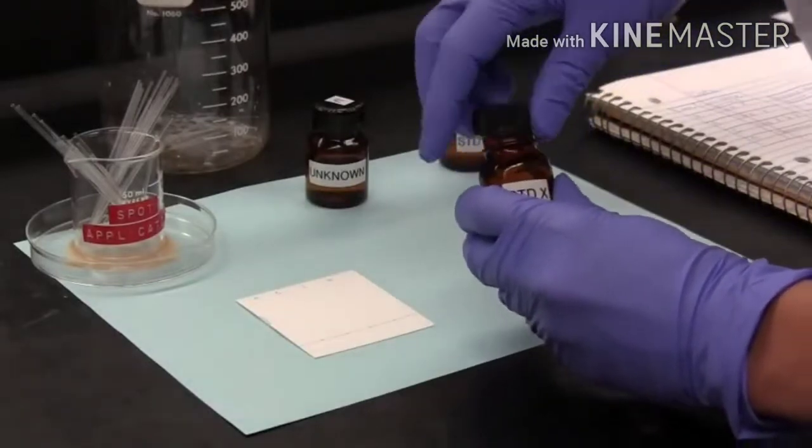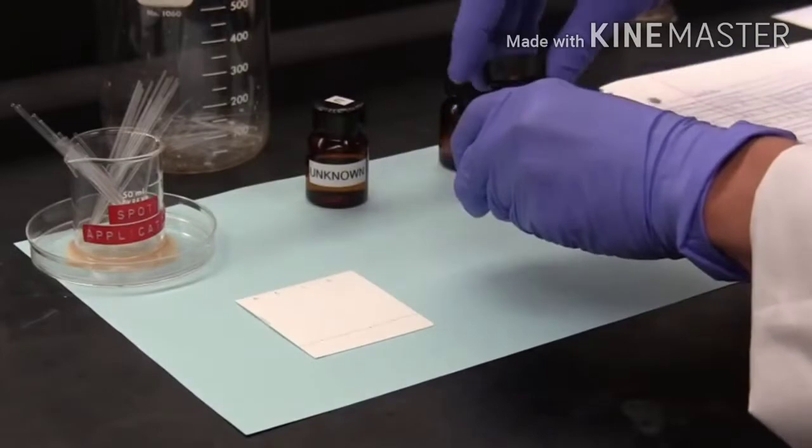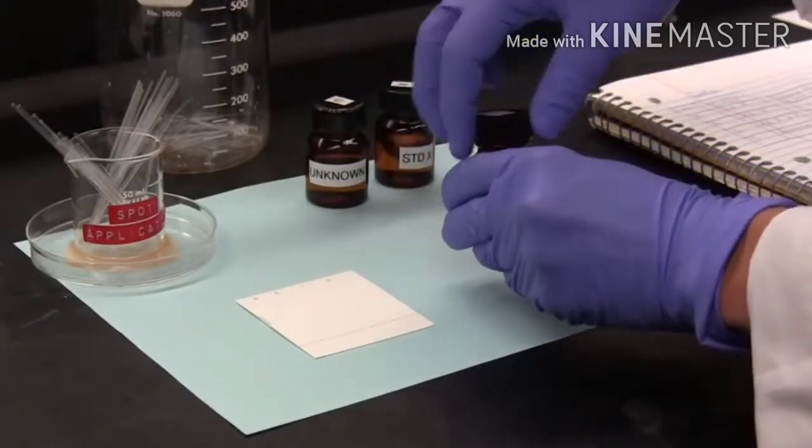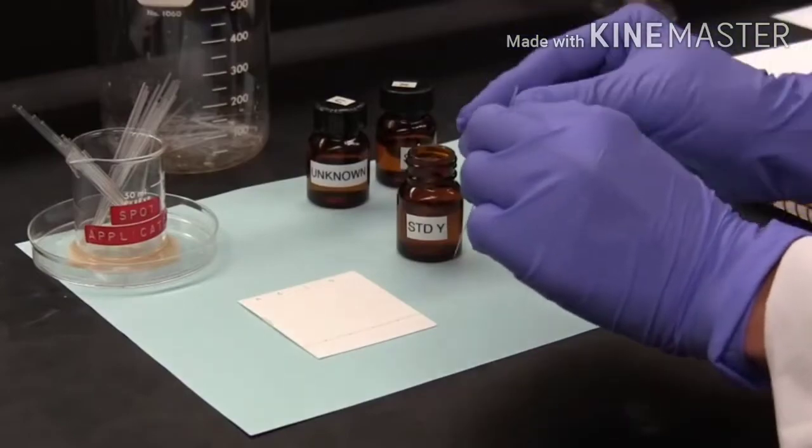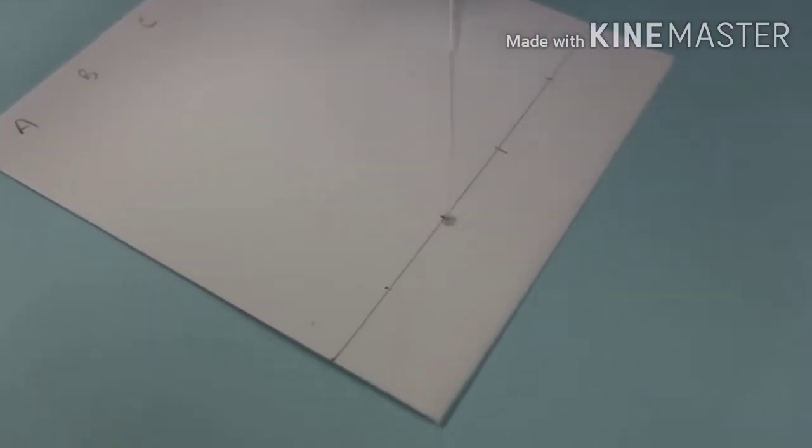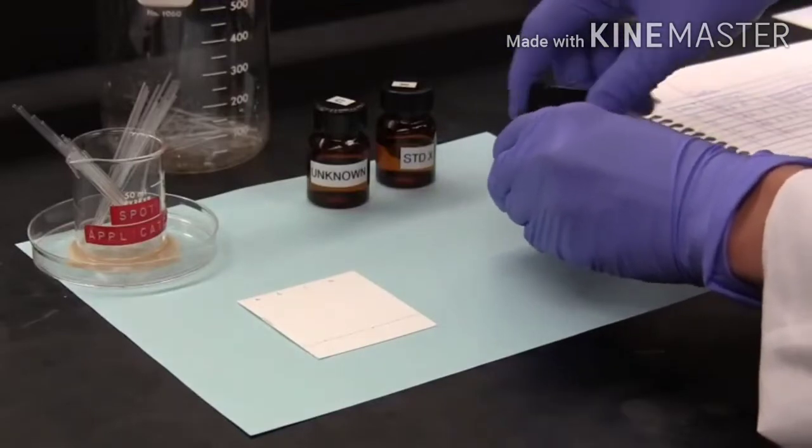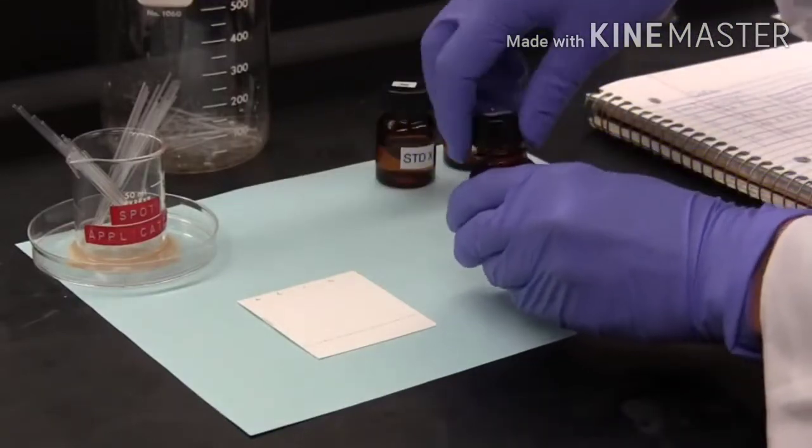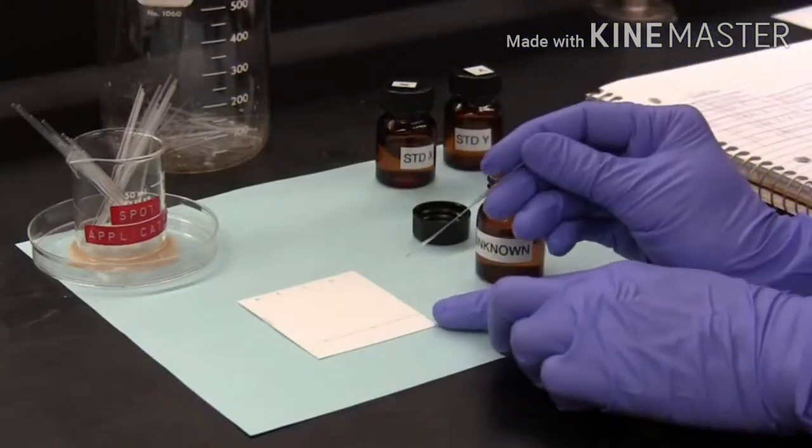The first part of the TLC analysis is to spot the plate. We use a capillary applicator to apply a spot of standard X at the origin in lane A, and again in lane C. Now in lane B at the origin, we apply a spot of standard Y, and once more at the origin in lane C. Note how we use a clean capillary applicator with each solution. This is to avoid cross-contamination between the lanes.